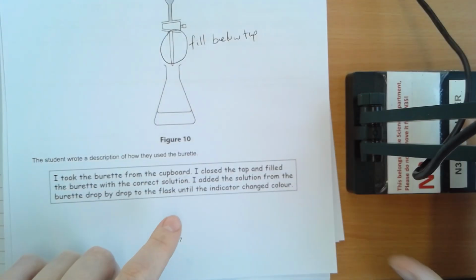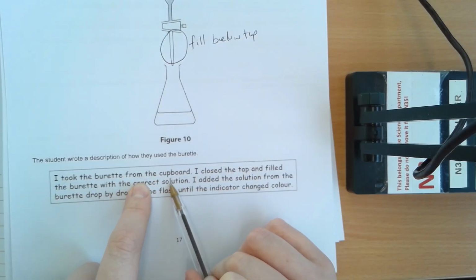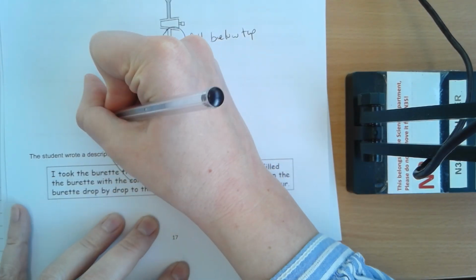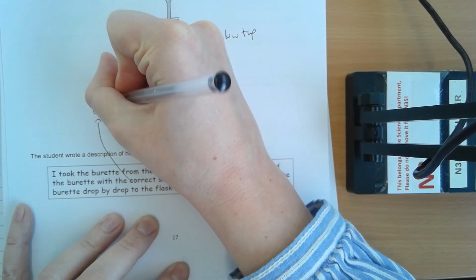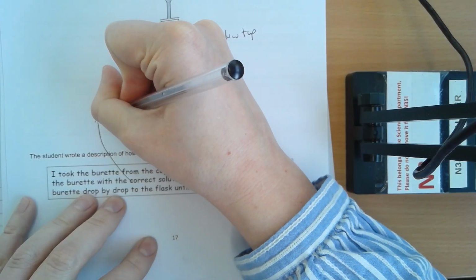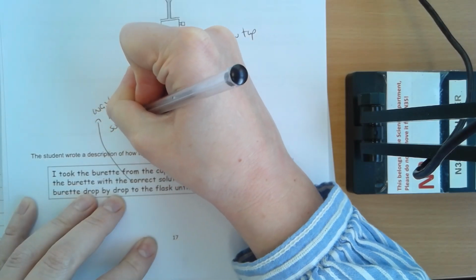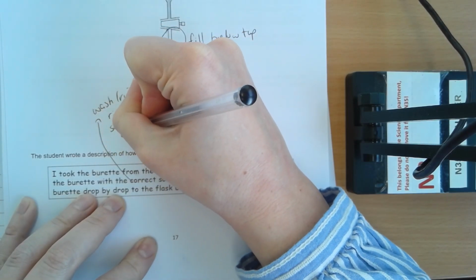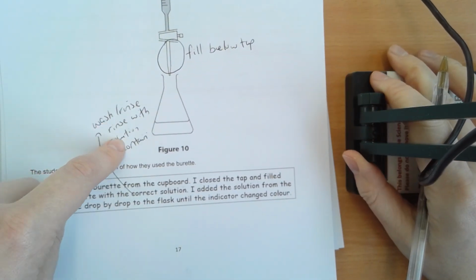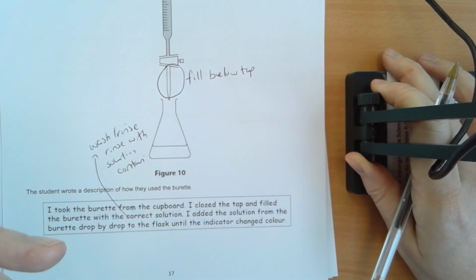The other mistake the student made, it says they took it from the cupboard and they filled with the correct solution straight away. Usually you'll wash it or rinse it with water, and then to remove that water you rinse with the solution it's about to contain. So if your burette was going to contain HCl, you'd give it a little rinse through with water, then you'd rinse out the water with HCl. So you'd let the HCl flow the whole way through and then you would fill it up properly.